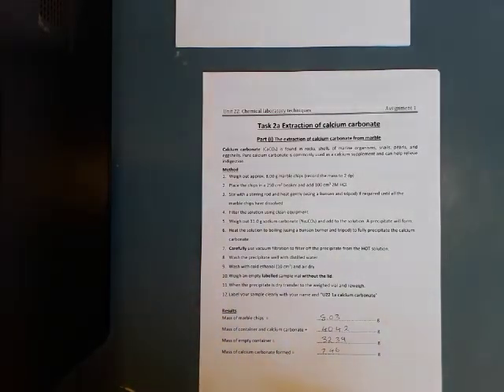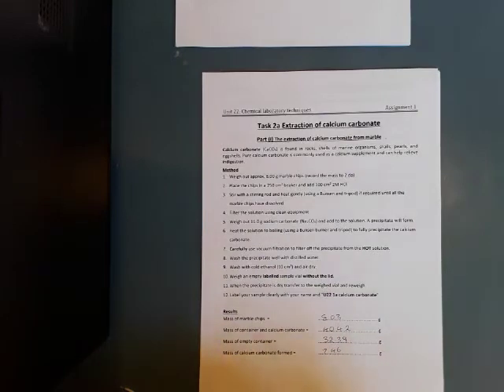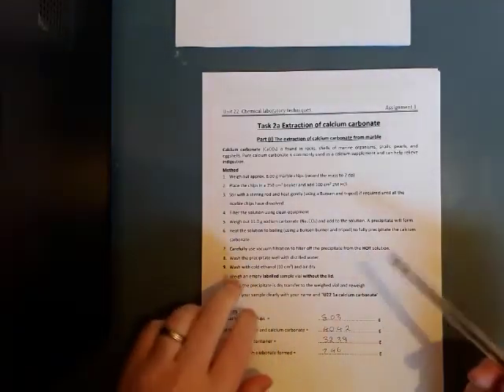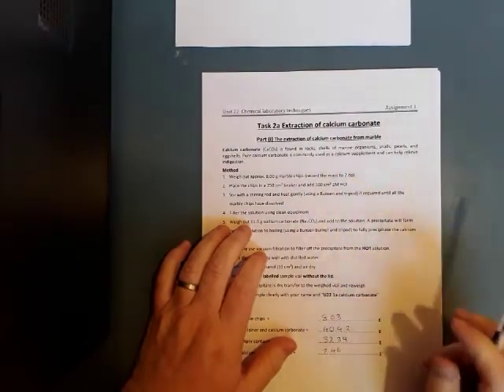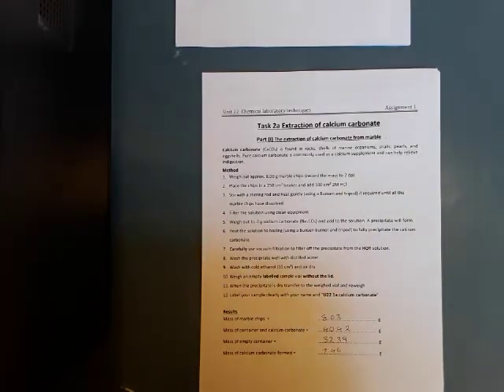Okay. So obviously, starting off, we're weighing out the marble chips. We're then placing the chips in a beaker and then adding the 2 molar HCl. Then with the stirring rod, we're going to heat it gently until they've all dissolved. Calcium carbonate isn't really soluble in water, and of course we react it with HCl so that it will dissolve.